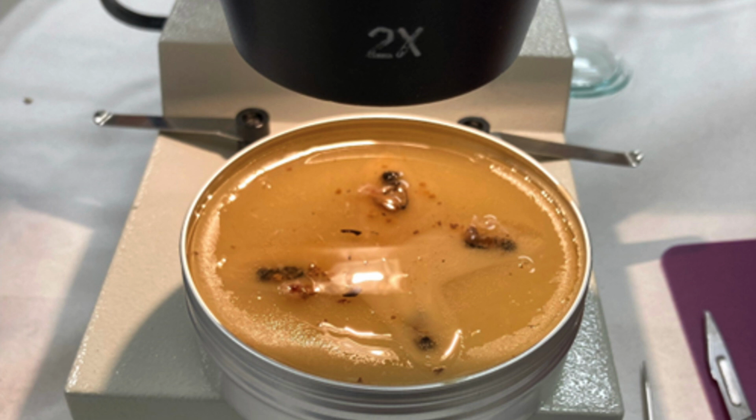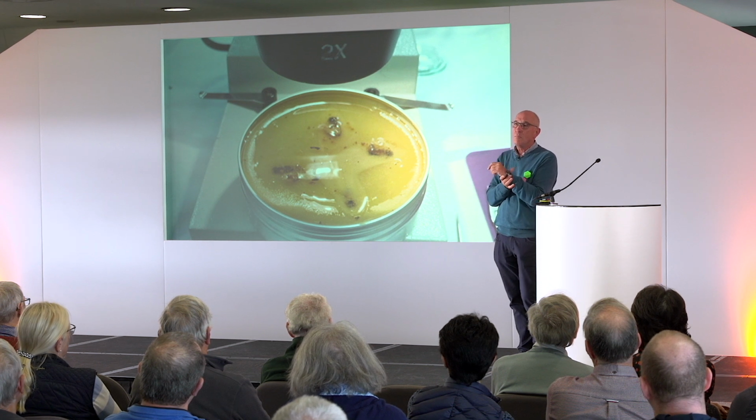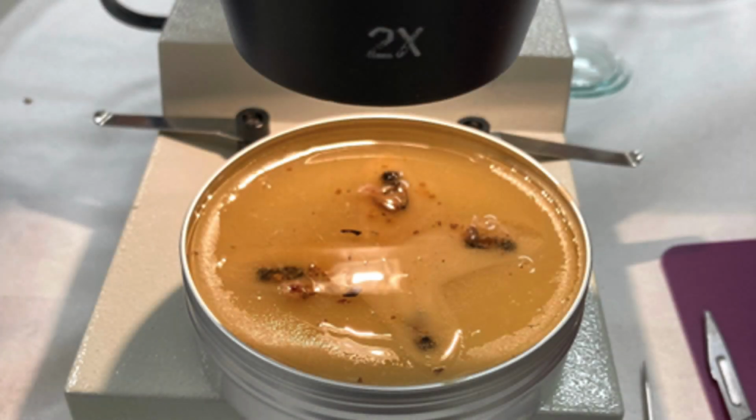The wax, when you've embedded the bee in it, is holding the bee. I like to use as dirty a wax as possible. This is pretty clean for me, because when you take the shell off and look inside, you want to take the inner parts off. You want to look at the ventriculus, which is the intestines, and the rectum of the bee. A lot of the components inside are white. If you have a nice yellow wax and you bring the components out, the contrast isn't there. But if you have a dirty wax, my best wax is dark brown, then the contrast works very well. And you can see I've got my ×2, so it's on 20 times magnification, and that's all you need for dissecting a bee.